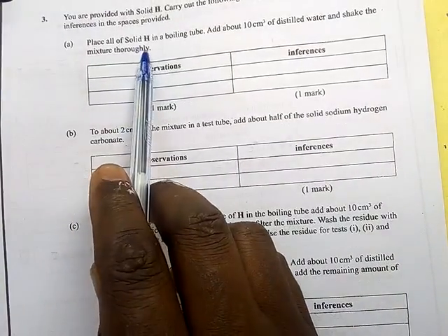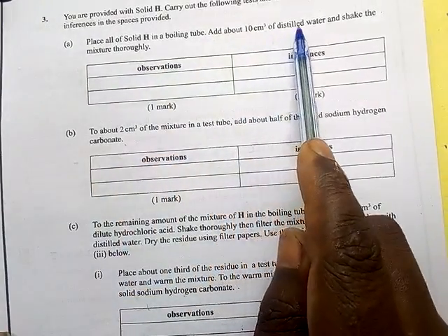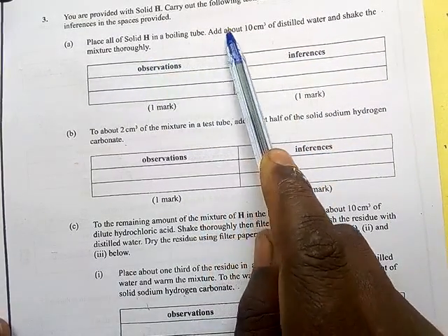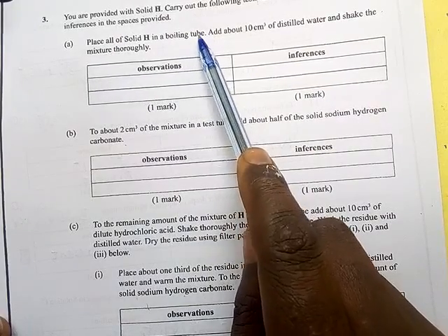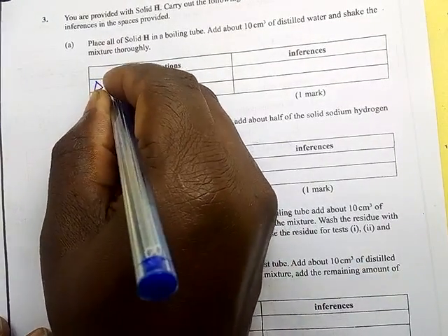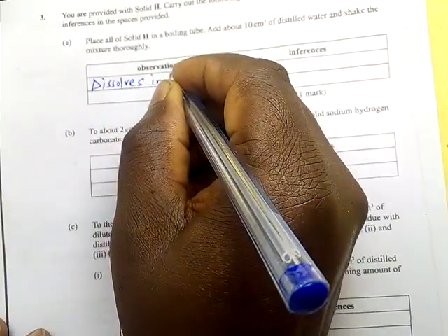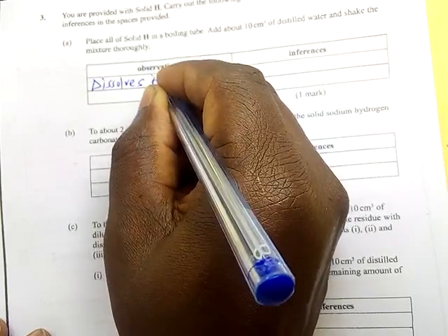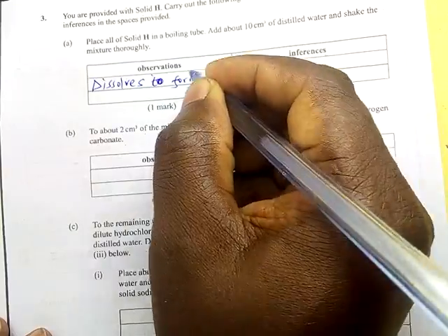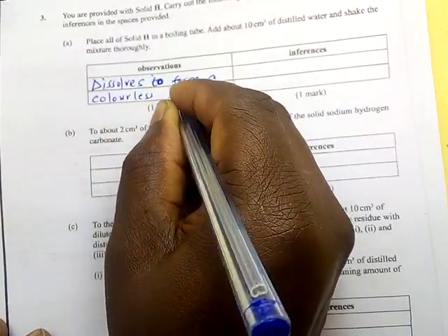Place all solid H in a boiling tube. Add about 10 centimeters cube of distilled water and shake the mixture thoroughly. So we want to find out whether this solid is dissolving in water or not. So the solid dissolves in water, and dissolves to form a colorless solution.